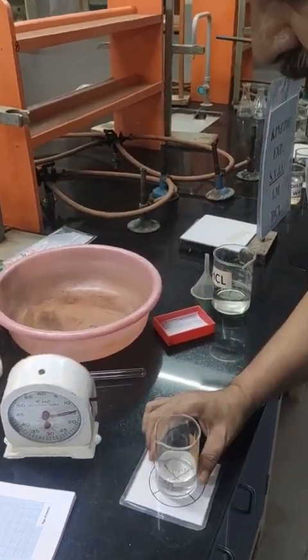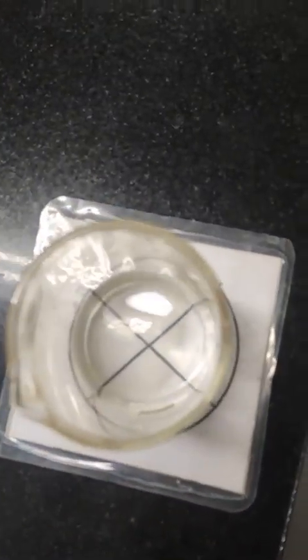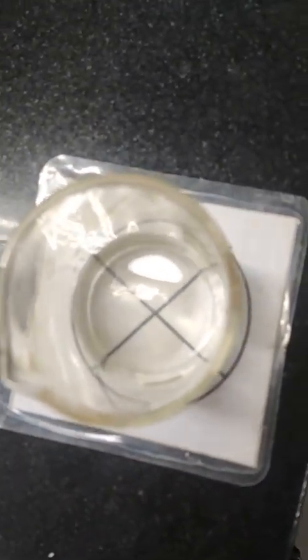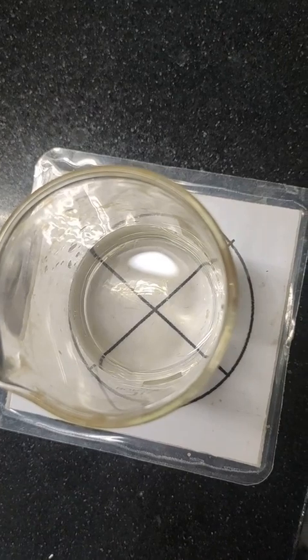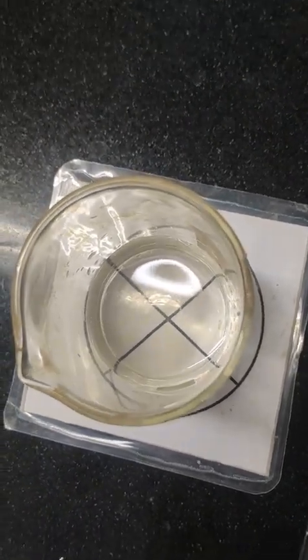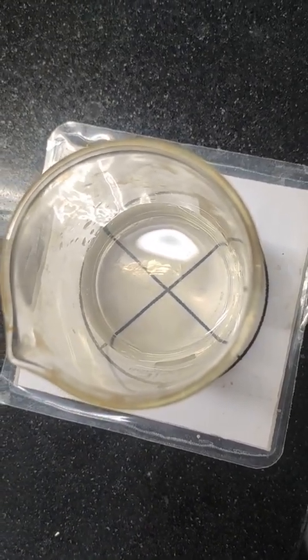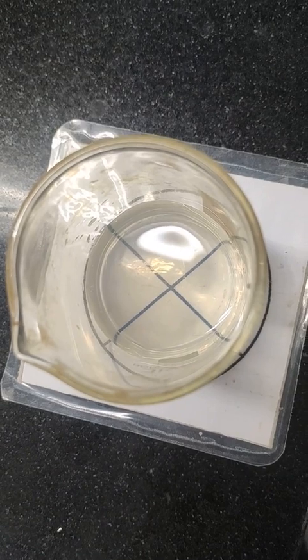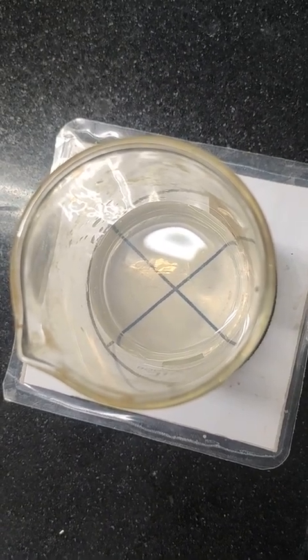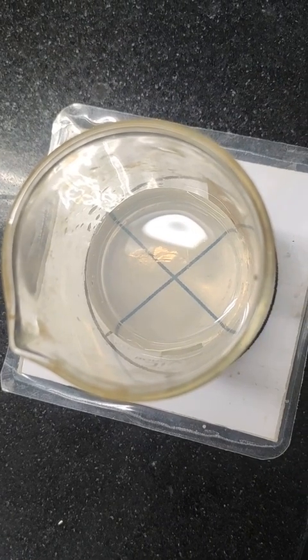And as the time passes, once again we will observe this cross mark from top of the container. The solution will start becoming turbid and this cross mark will slowly become invisible.